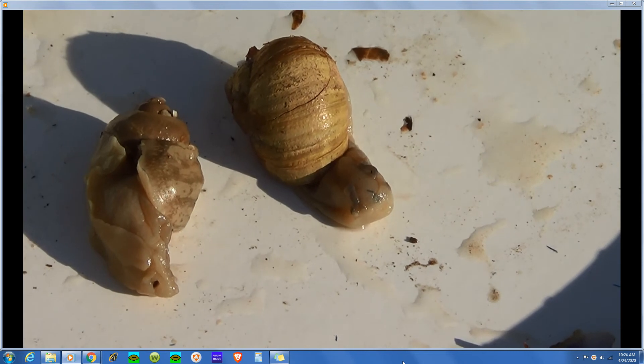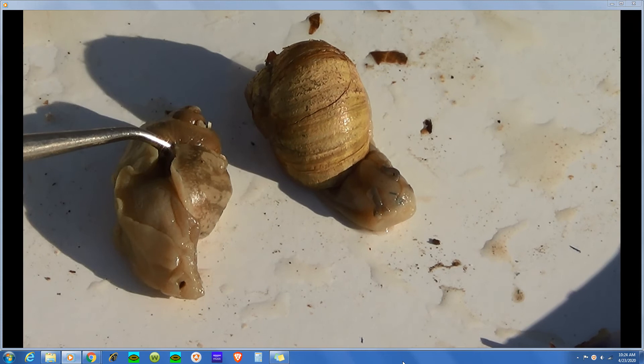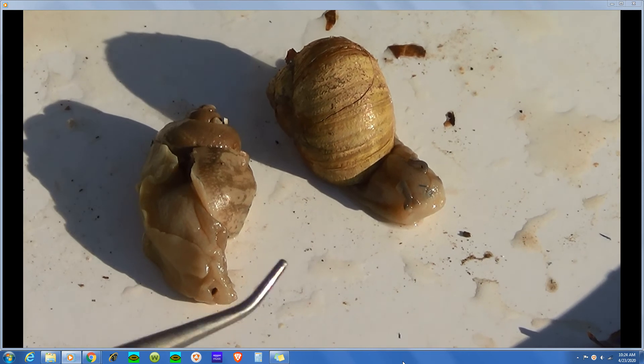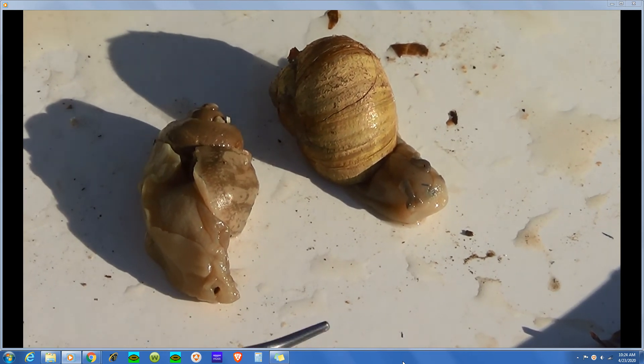These are both snails. What I've done is I've already taken the shell off of one of them, and left the shell on the other, so we can make a comparison and see the features with and without the shell — internal and external anatomy. So let's look at external first.